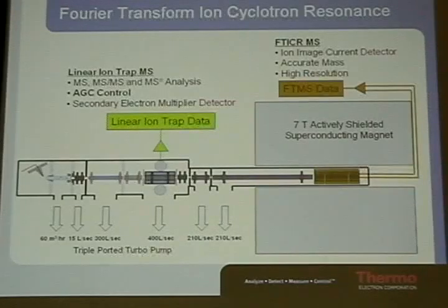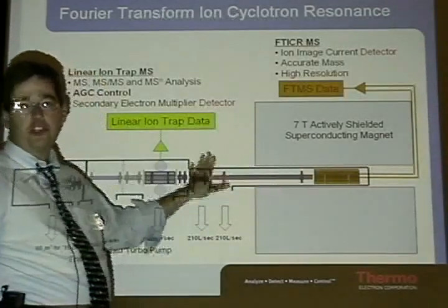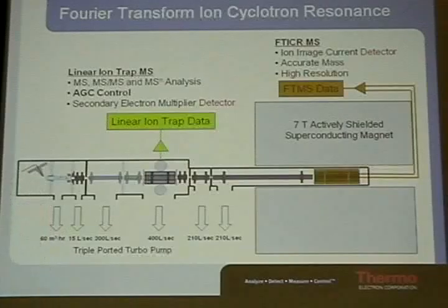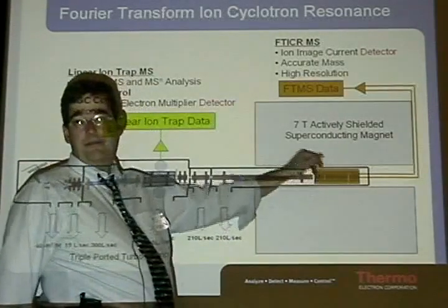Okay, now, there are several things you have to calibrate. The first one is you have to calibrate these voltages on all these transmission optics. Those voltages are mass dependent. So first and foremost is the voltages, the actual offsets and the RF intensity on those transmission optics creates a mass bias. The second mass bias you have to overcome, okay, is the flight time.